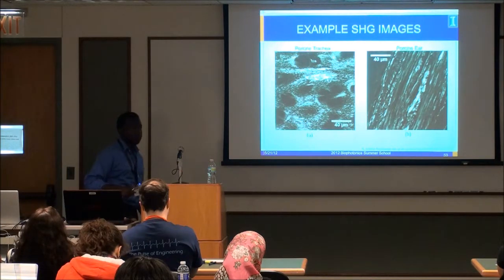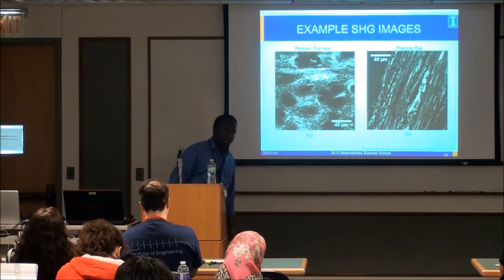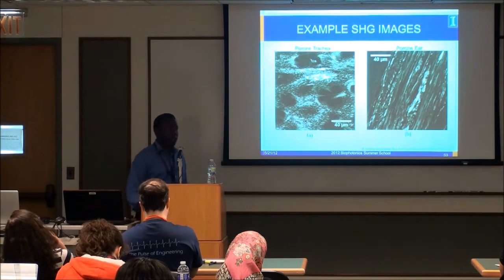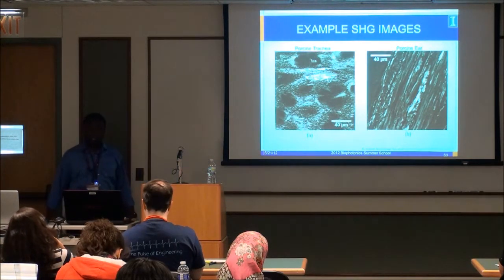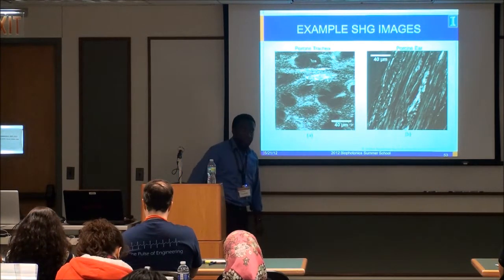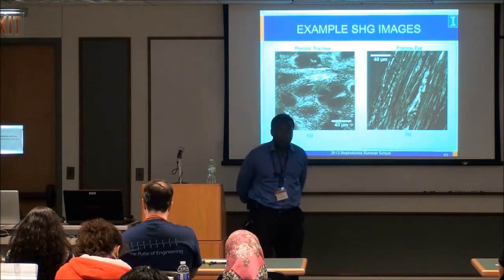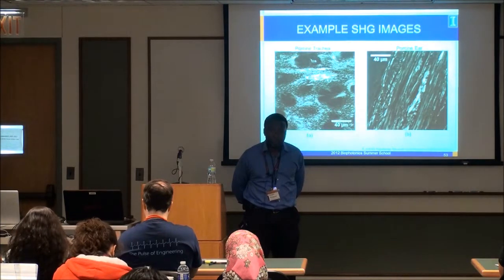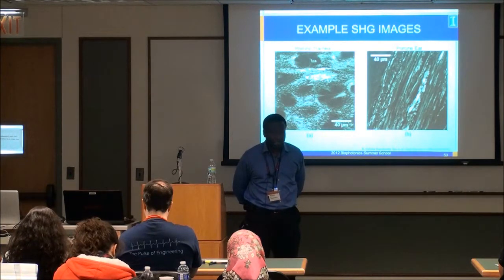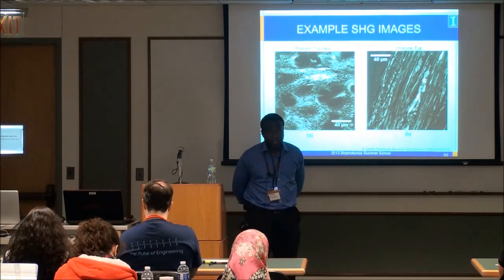Is type 1 collagen the only structure that you can see? No, myosin, muscle fibers. It turns out, apparently, that you have these polarized nerve fibers that people have actually imaged, embryonic neural development from embryonic zebrafish, as recently as the last 2 years in vitro.